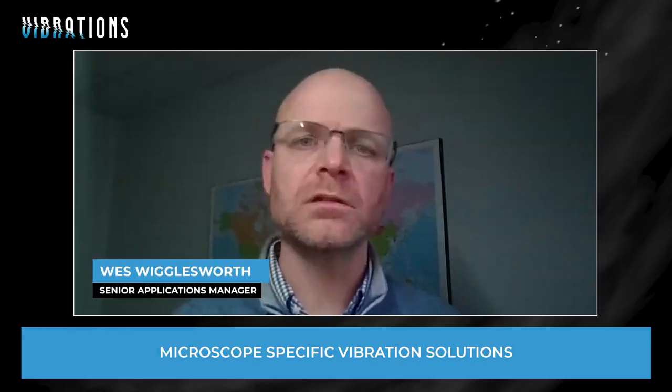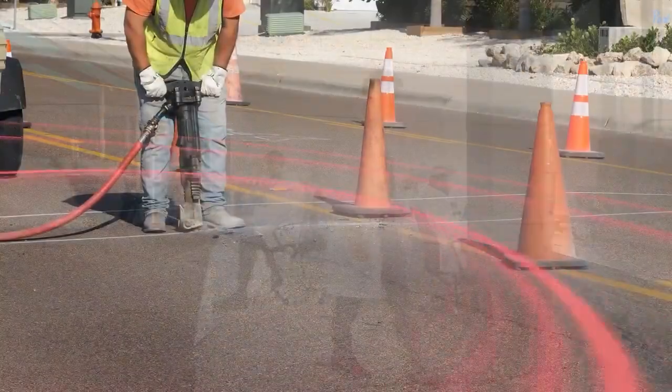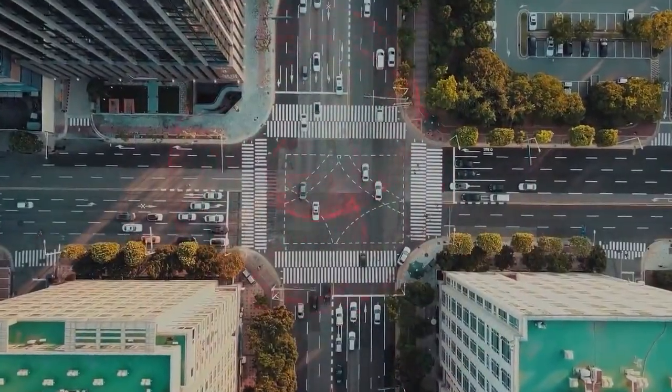Inevitably, vibration levels will increase as the facility becomes more mature, populated with other machines, foot traffic, people walking through the building, construction outside. I think you mentioned earlier traffic. We need to measure that facility when it is mature and populated, because there will be a different level of vibration. So really understanding all that is important.